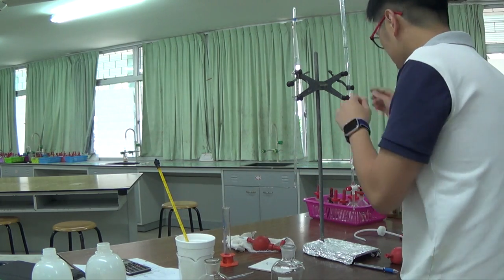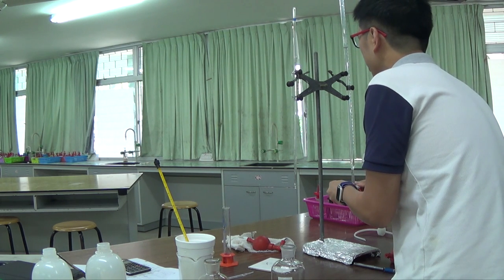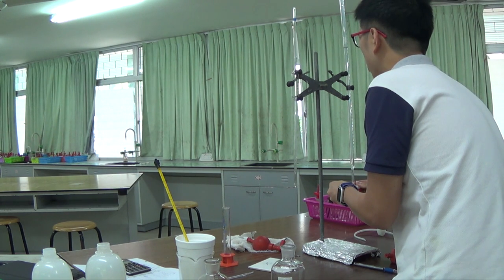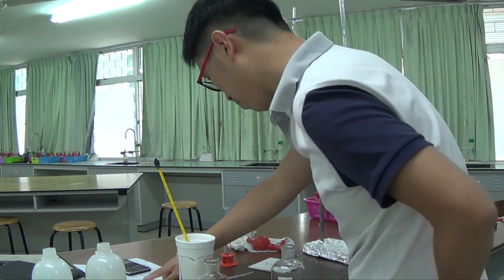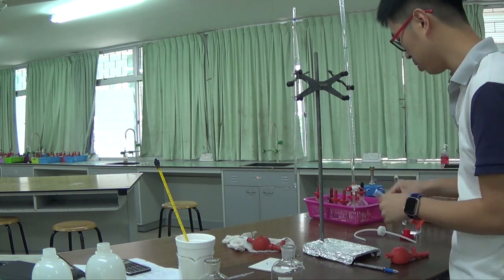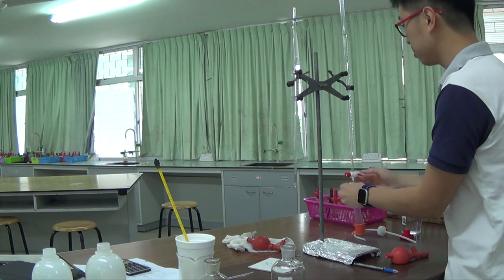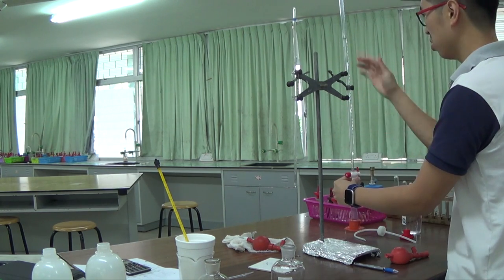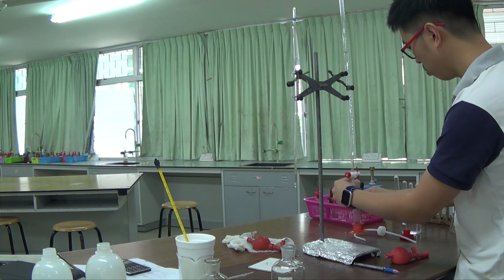So now this burette is supposed to read 20.00, but it's just a bit low, so I'll get rid of maybe one drop. Okay, so that's 20.00, and I need 25.0, so essentially fill up the measuring cylinder with no need for any addition of water. So 20.00 plus 25 is going to be 45, that's why I needed to refill my burette.